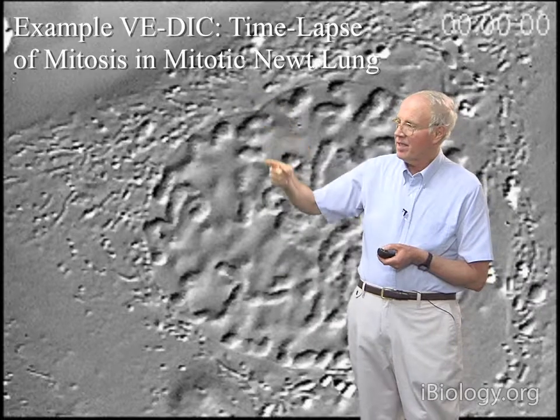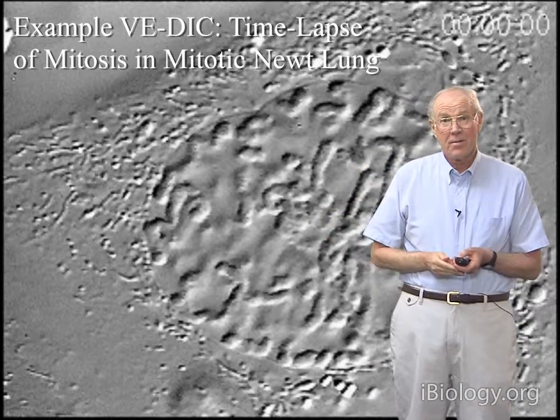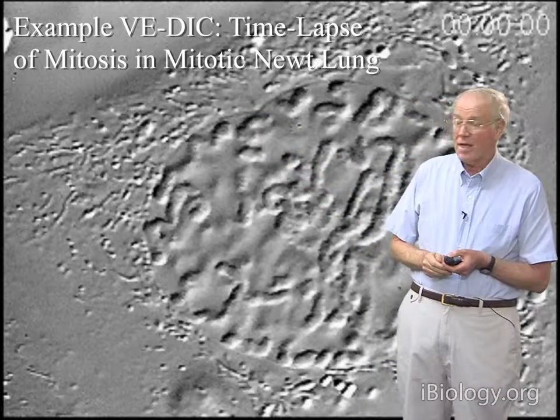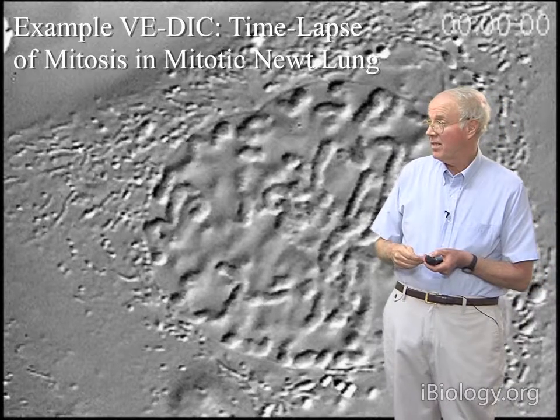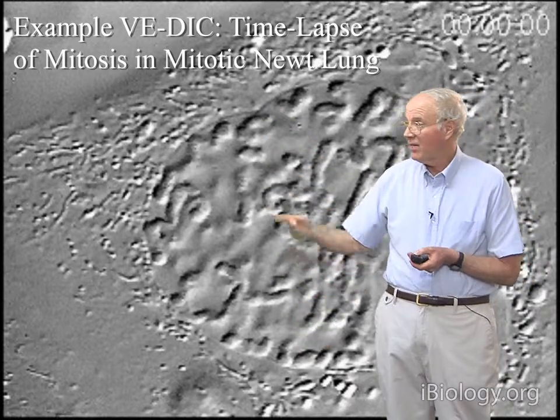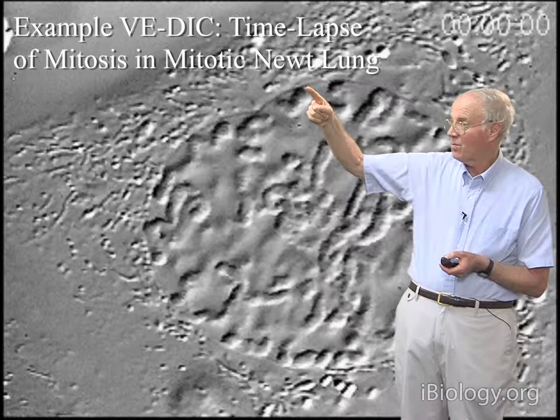And with this contrast enhancement, you can make the depth of focus in the specimen as narrow as about 250 nanometers. And Shinya Inoue has a nice paper on that. So if you search for that, somewhere around 1989, 1990, it's very nicely demonstrated there. And so this is a fairly thin optical section through this nucleus, and these are the condensed chromosome arms, just about ready to get into mitosis at the time when the nuclear envelope breaks down.